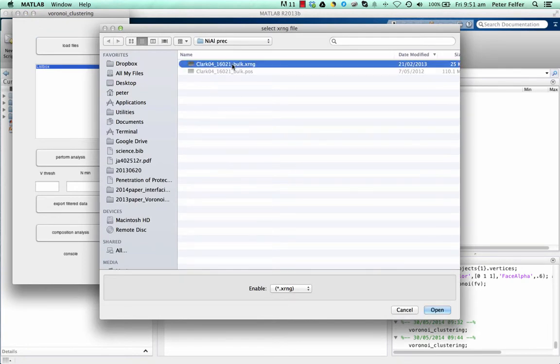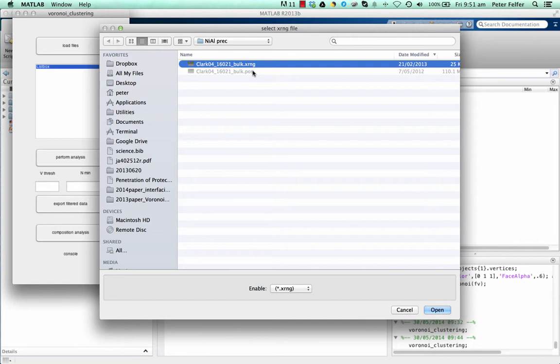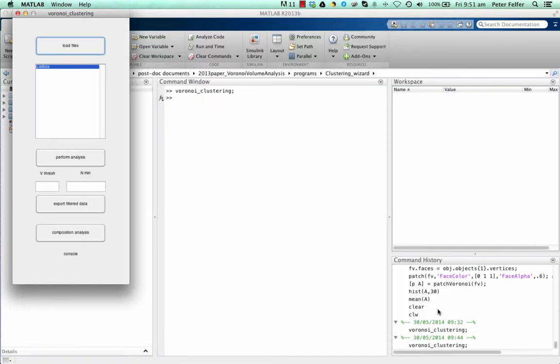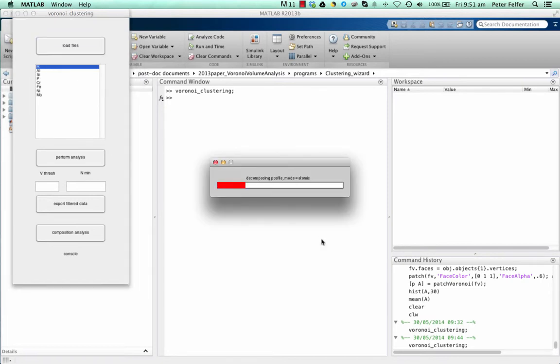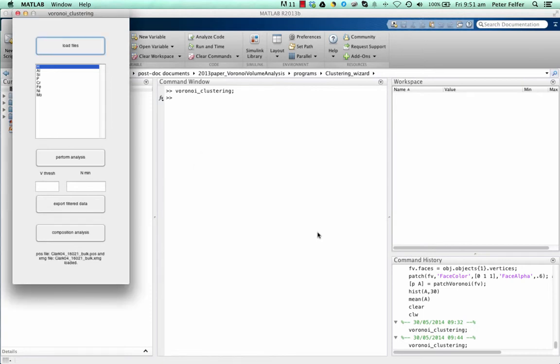Then you read in the windowing file, which is in .xrange format. This is a format that I've come up with, and it's XML-based, which means if you're programming analysis yourself, any programming language will be able to read it in straight away. In order to produce these files, just go on to my webpage, www.peterfelfer.org, and you can download an editor that can produce these from .pos and .epos files.